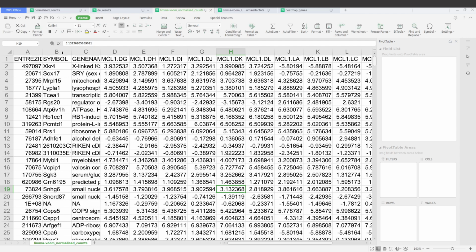So just consider the names, or let me just say the symbols, as IDs that we can now use to extract other information. Okay. So let's say if it's a database, you have your student ID or whatever, or staff ID. Then once you put in the staff ID, you can get information about you. It's all linked. So this time we are going to use the gene names, or let me just say the gene symbols, to come to this table, which we'll do in R, by the way, and then extract the normalized counts that we want for the heat maps.